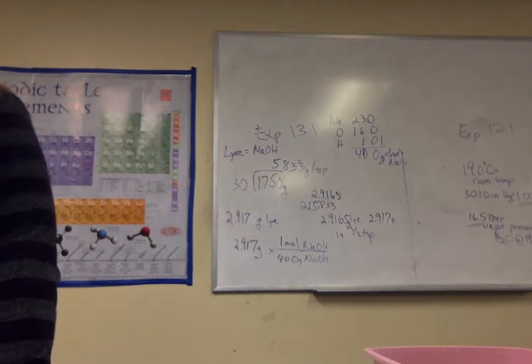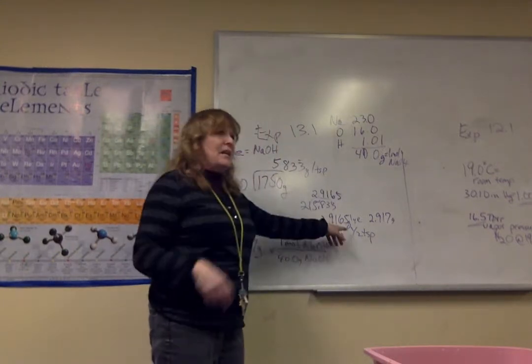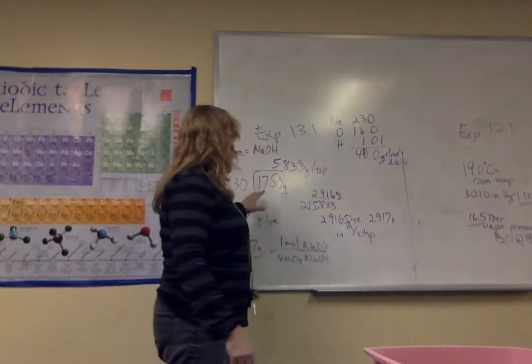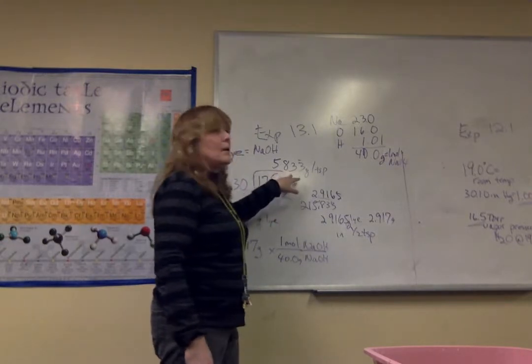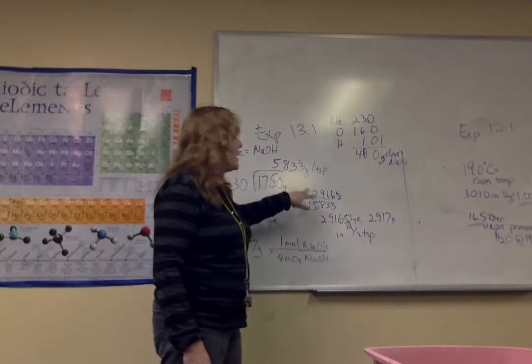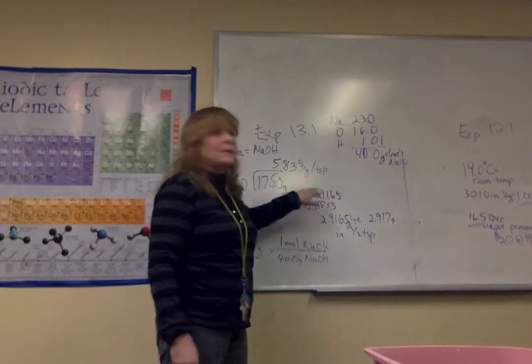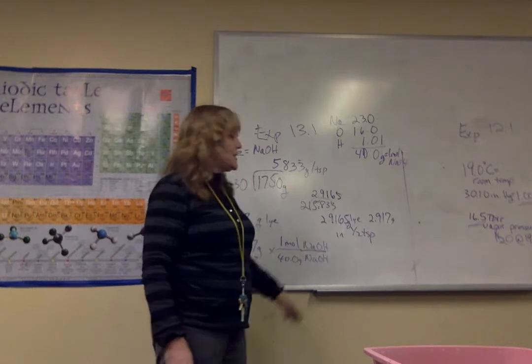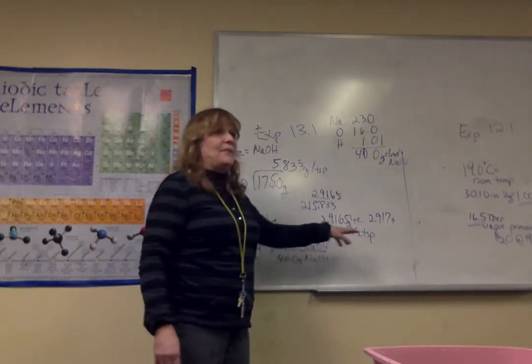What's the mass of the lye? It's over here, 2.9. This you have to show by calculation, so you can't just put this down. You have to show the calculation of this one. Yeah, I did. I had to measure 30 teaspoons out, divided by 30 teaspoons to find the mass of 1 teaspoon. Then I divided that in half to get 2.9 whatever. Significant figures, just 2 sig figs, right? 2.917, that's a half teaspoon. You have to do all that.